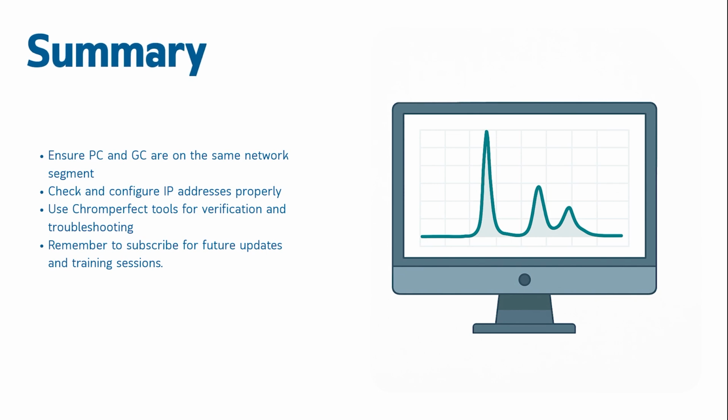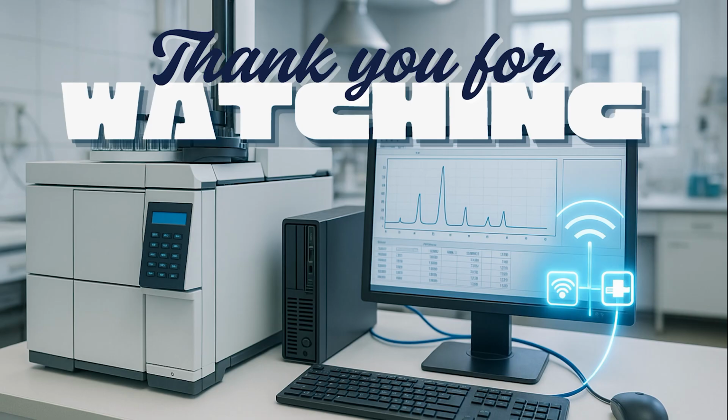If you see these connection errors, don't worry. They simply mean the GC and the computer are on different networks. Make sure the first 3 sections of the IP address match, and Chromperfect will be able to communicate again.